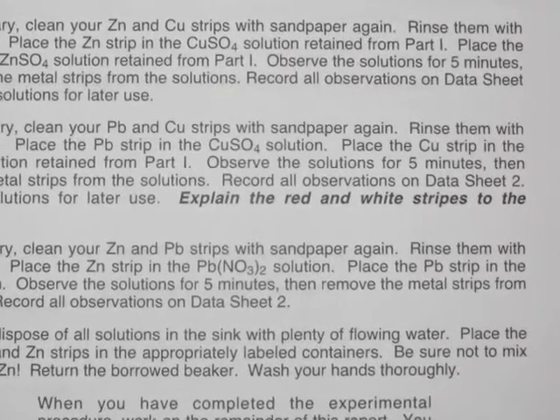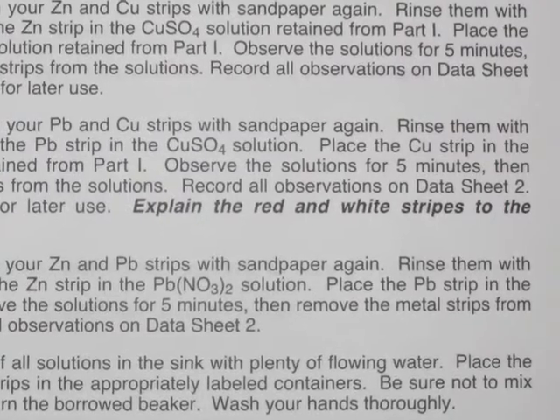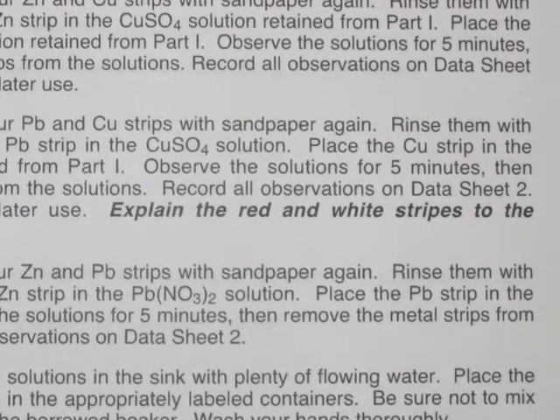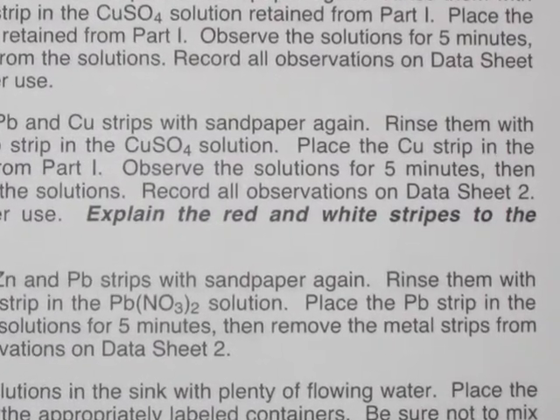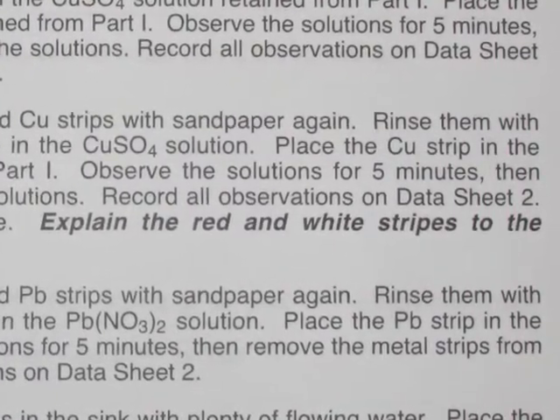Explain to the instructor is the perfect instrument to focus their attention on the red and white stripes that form on the lead strip immersed in copper sulfate solution. Watch two students of different ability tackle this problem, and note too how deeper learning is encouraged by the one-on-one format.